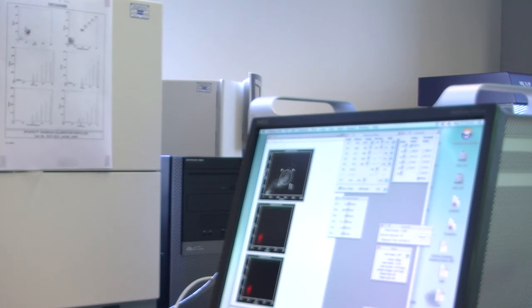But they're not the same cell type, are they? I can't remember what they are. Because they're not the same cell type, we wouldn't expect them to have the same size and granularity. Now we're running at 60 cells per second there. I'm just going to go up to medium to push up to about 100 cells per second. I don't want to go any faster than that. It's not optimal running it faster for various reasons. So I'll just push it through at medium.